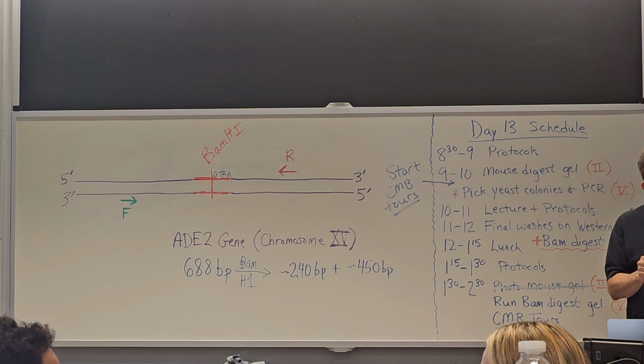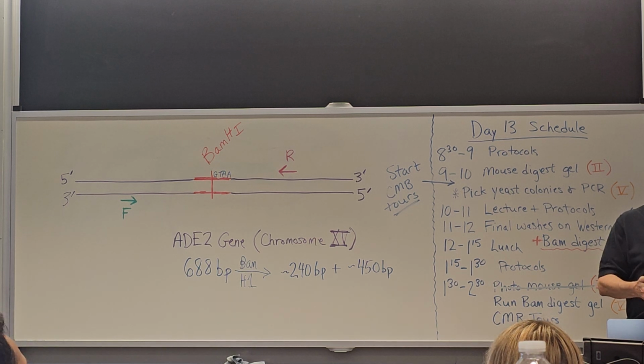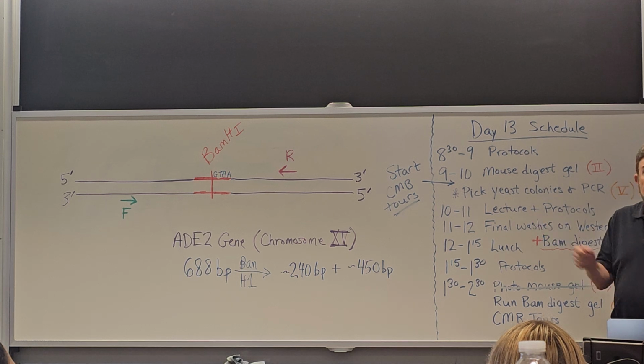let me back up a little bit on the CRISPR. So I told you earlier today that if you don't have a nice color thing like we did, and for 99.9% of genes, you're not going to have some kind of nice color change like we have with this experiment. I specifically designed this experiment this way because of that color change, right? So that we could pick pink colonies and stack the deck in our favor. But if we were CRISPRing any other gene in yeast, we wouldn't have that.